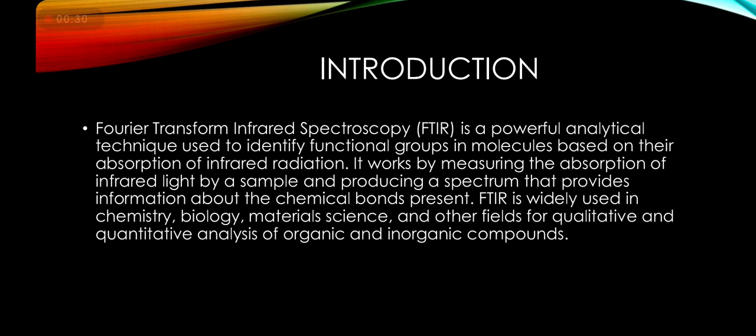Fourier transform infrared spectroscopy is a powerful analytical technique used to identify functional groups in molecules based on their absorption of infrared radiation.